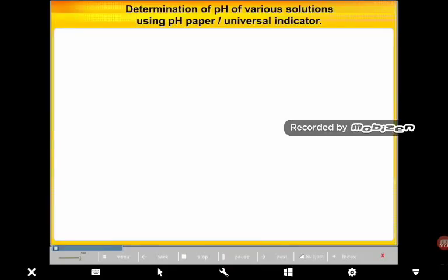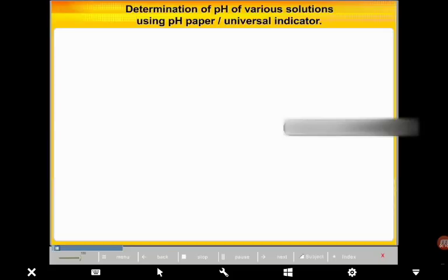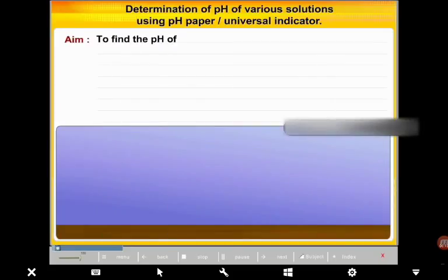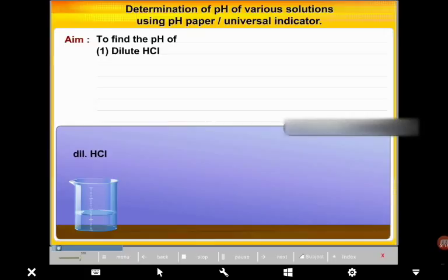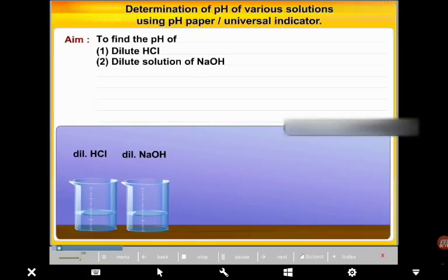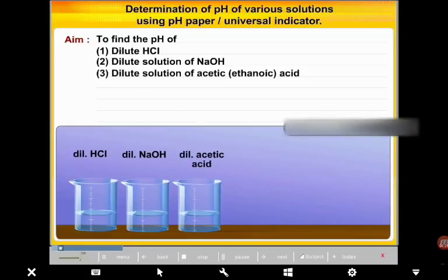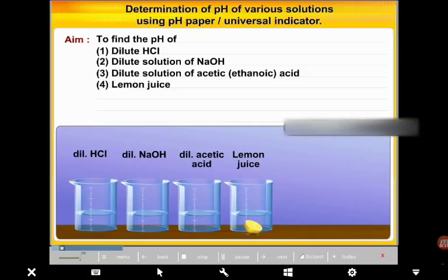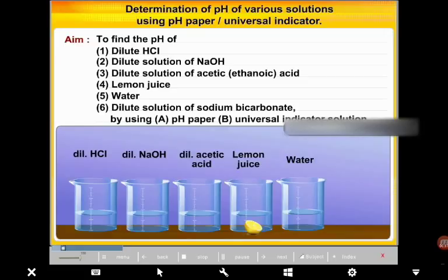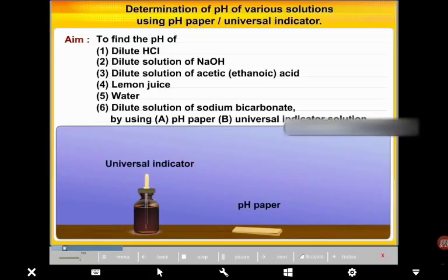Experiment 1: Determine the pH of various solutions using pH paper or Universal Indicator Solution. Aim: To determine the pH of the following samples — (1) dilute HCl, (2) dilute solution of NaOH, (3) dilute solution of acetic (ethanoic) acid, (4) lemon juice, (5) water, (6) dilute solution of sodium bicarbonate — using (A) pH paper and (B) Universal Indicator Solution.